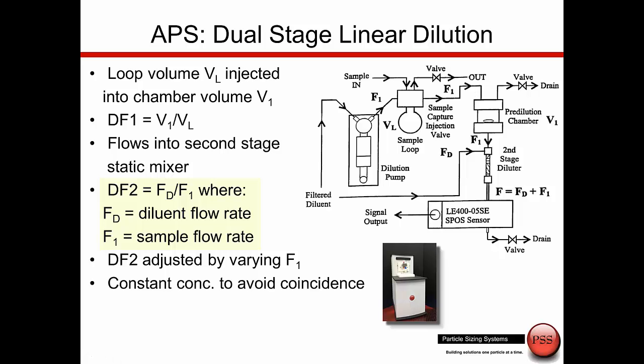We could talk about doing a dilution factor of like 1,000,000 to 1 if we need to, and very accurately still understand the count and concentration passing through the sensor. So for emulsion samples, we typically use the AccuSizer APS, which is a dual-stage dilution system.